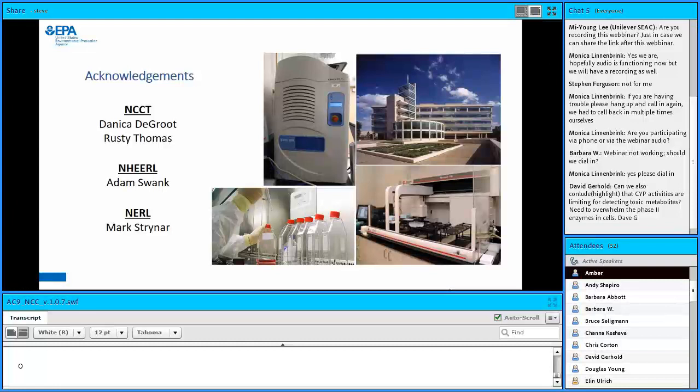One of the things we have talked about maybe doing, because some other people have done this, is they've looked at metabolism of carcinogens in NRF2-deficient mice and things like that, and shown that if you do disable some of these mechanisms, you can build a model that's much more sensitive for detecting reactive metabolites.